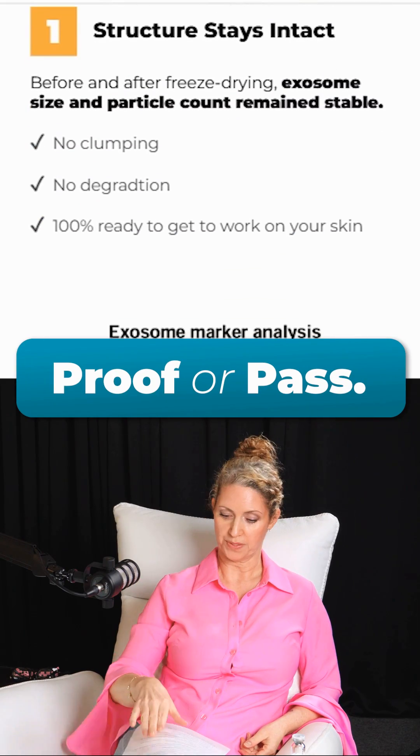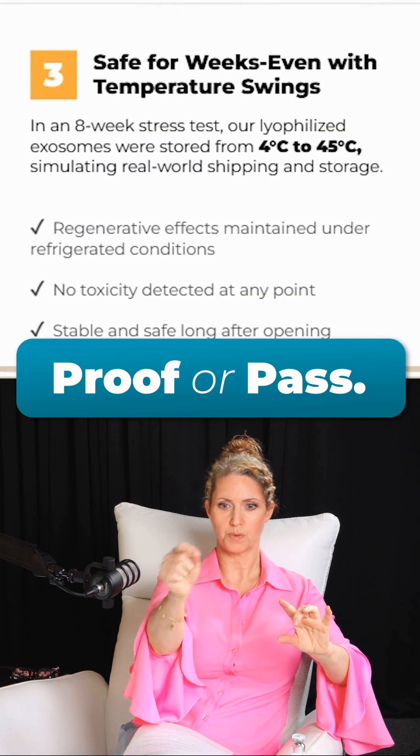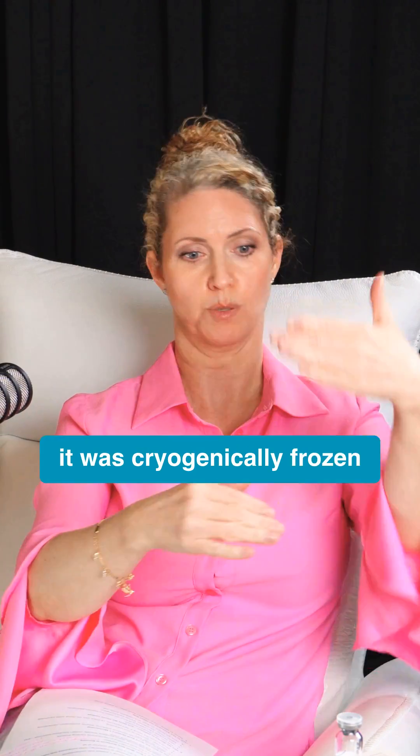Here are the photos of what the NS-300 spit out. This is before it was cryogenically frozen, and this is after it was cryogenically frozen — before and after. It's perfect, there's not a problem with this, and that's important.